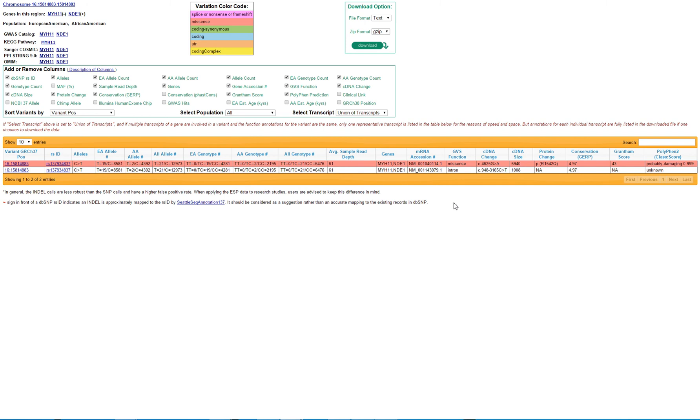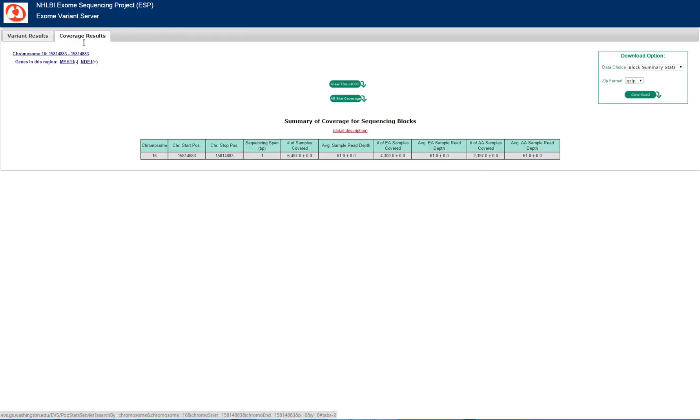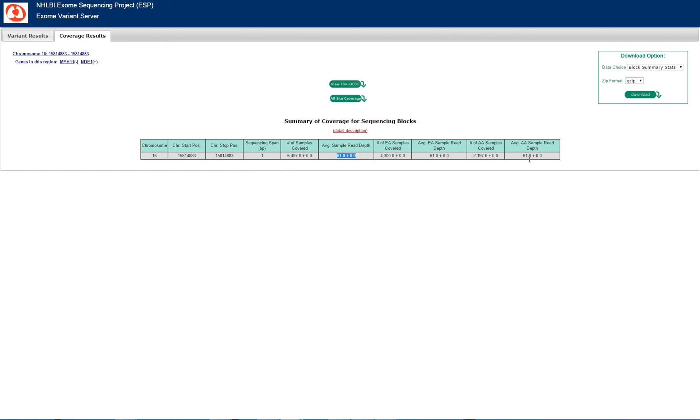You can use that to calculate allele frequencies. Another tool you can use is checking how good the sample read depth is, although this is represented in the other page. You can see that represented again by on average what it is for European and African Americans.